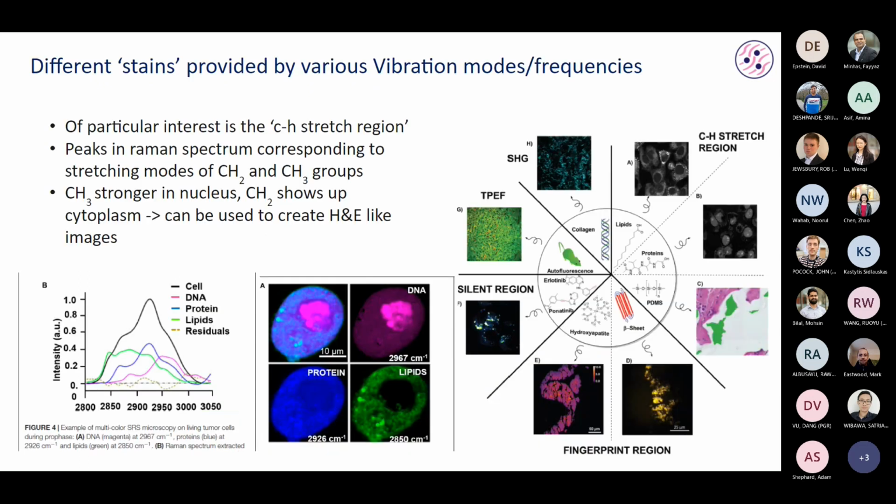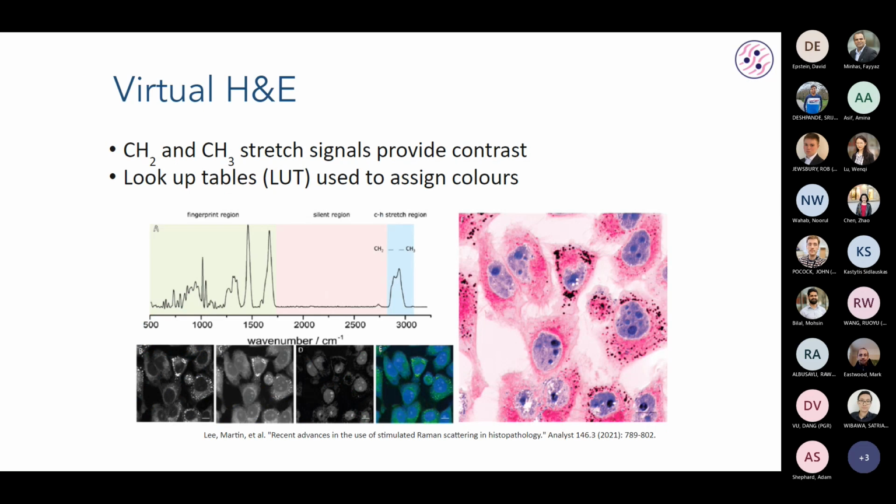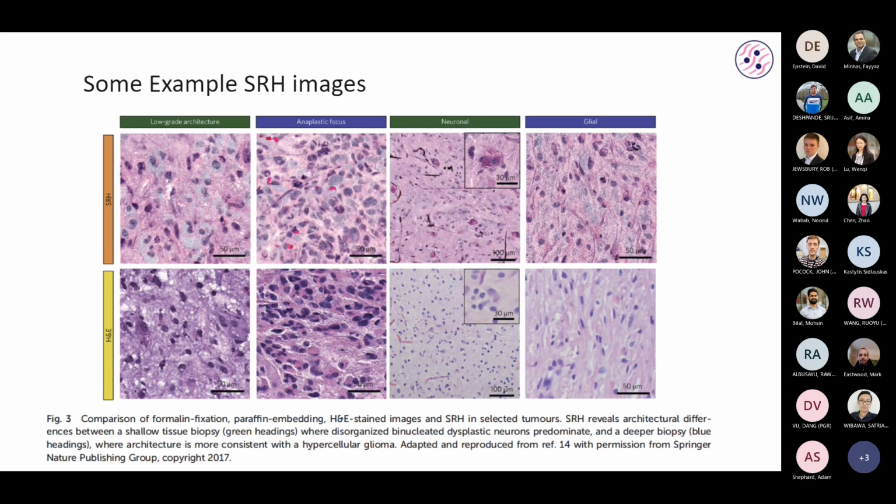It's a similar sort of resolution. As you can see from these images, they're able to image at a similar level of detail as H&E. From the scale bars here, you can see details down to about 10 micrometers or less. But the alternative to this is frozen sections, and we all know how bad those look, right?